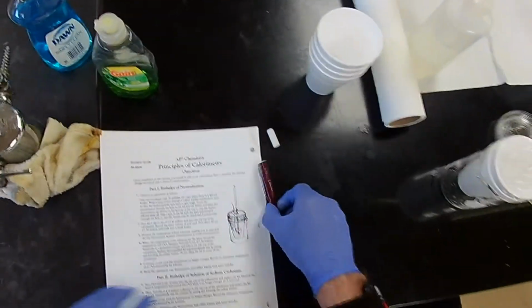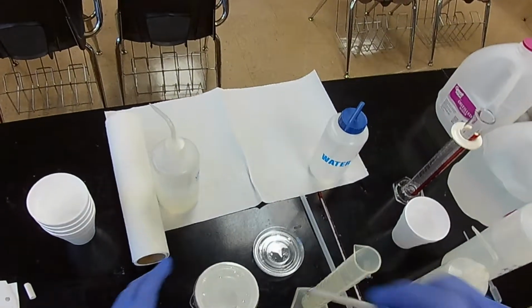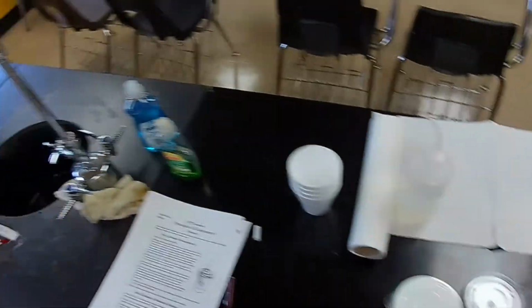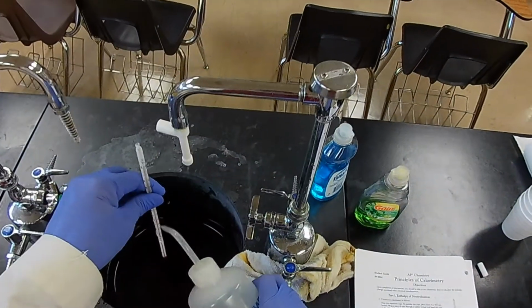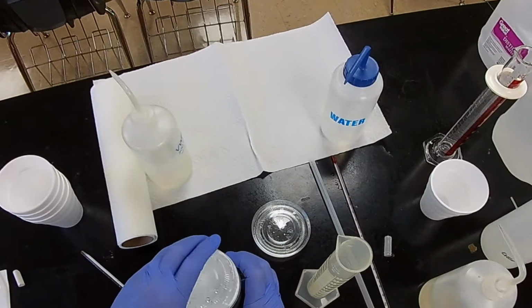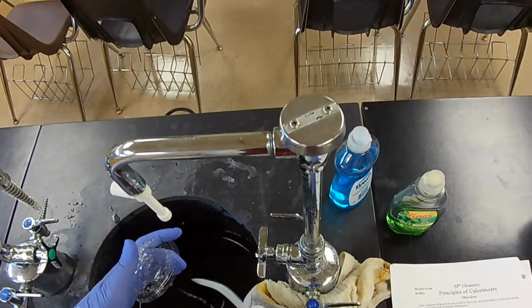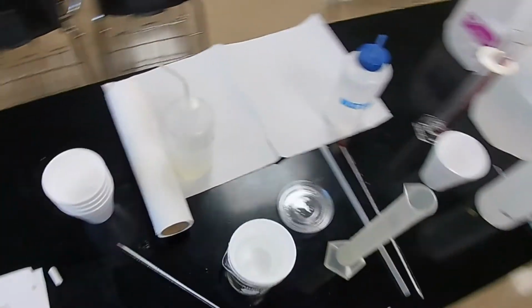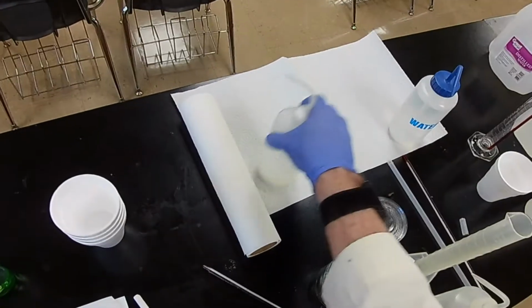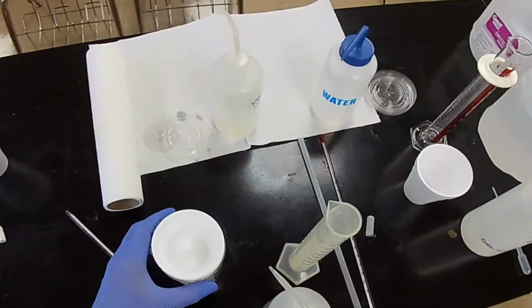Okay. So, what do we need for that one? Well, we need to start fresh. We need to rinse this off because there's excess acid. Remember? We put excess acid in there so that the reaction would be complete. So we clean our calorimeter. Make sure there's nothing left behind. Don't want to lose that lid because that is part of our calorimeter.